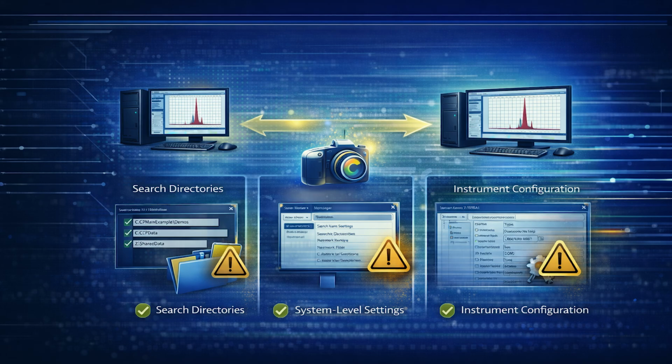Open the Instrument Configuration utility and capture the full settings for every instrument. This includes details such as IP addresses, network ports, COM port assignments, USB identifiers, and any other instrument-specific parameters. Having this information available makes reconfiguration faster, reduces errors, and avoids unnecessary troubleshooting.